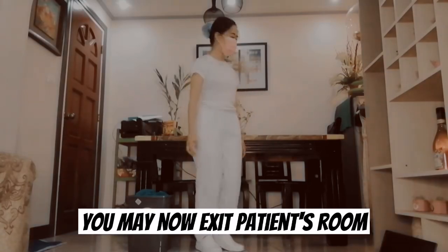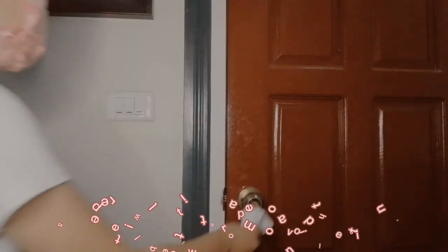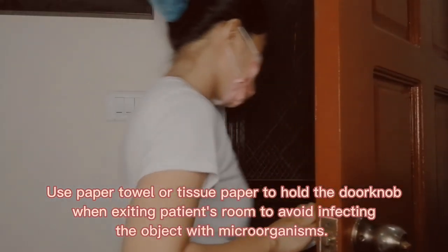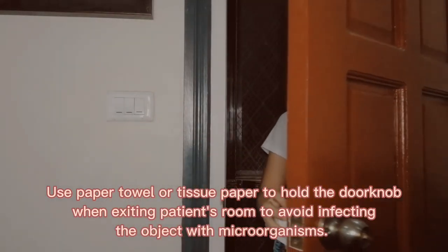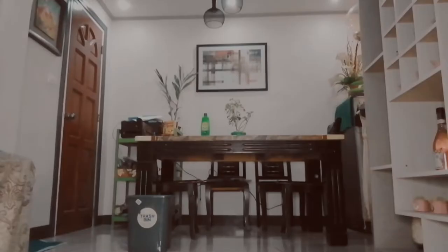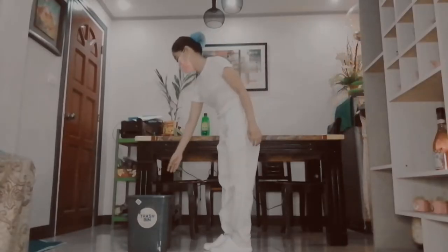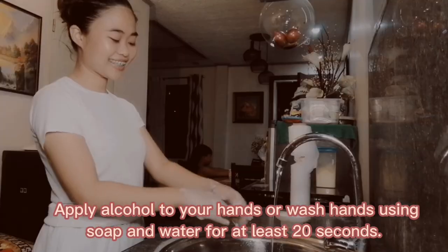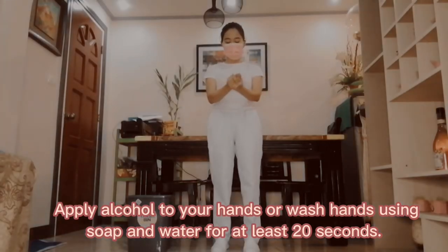You may now exit the patient's room. Use paper towel or tissue paper to hold the doorknob when exiting the patient's room to avoid infecting the object with microorganisms. Apply alcohol to your hands or wash your hands using soap and water for at least 20 seconds.